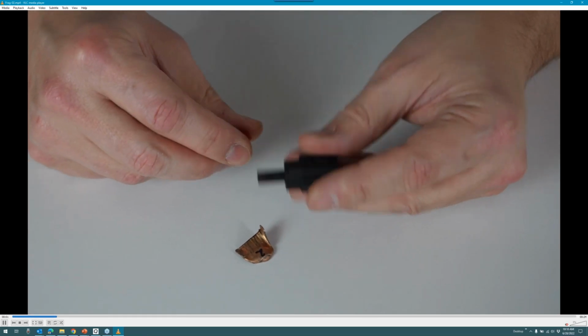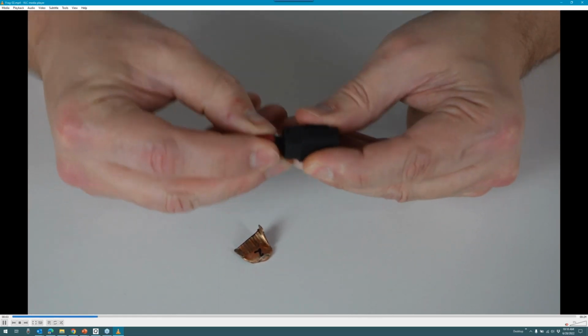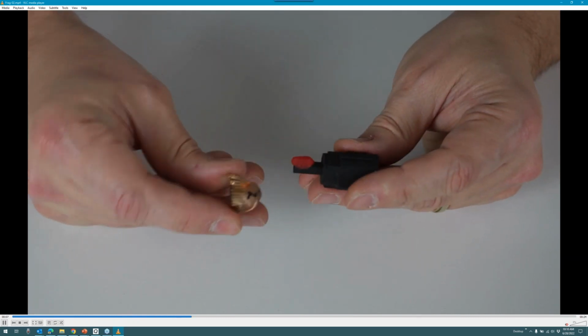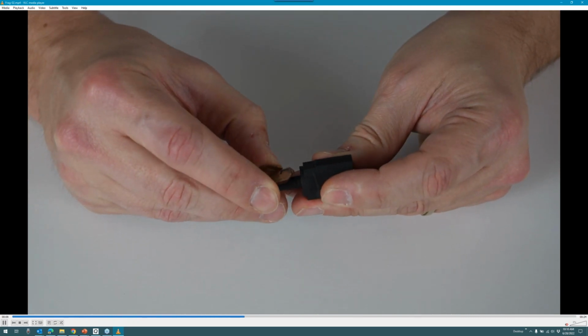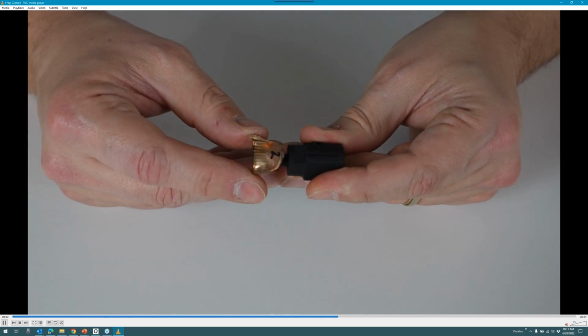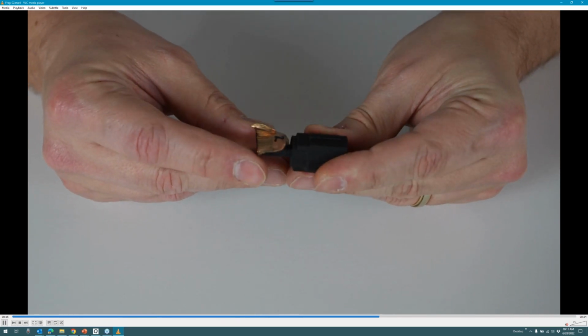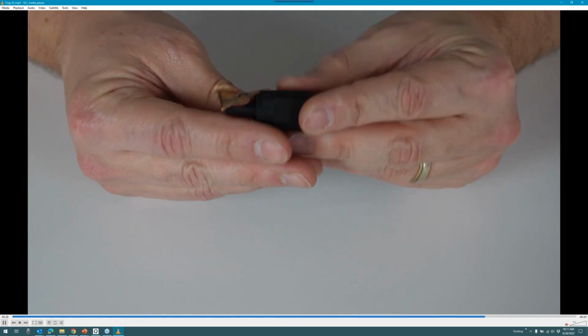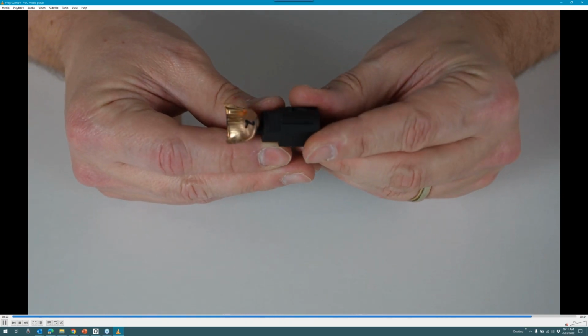There's number 2 sitting on the table itself, lining up the wax with the dash, and now this gets placed inside. And so the midpoint of the region that I intend to transition across during this acquisition is essentially right through the middle of land impression number 2. And that's him mounted on, ready to be acquired.